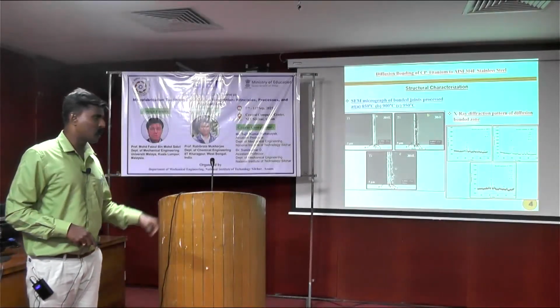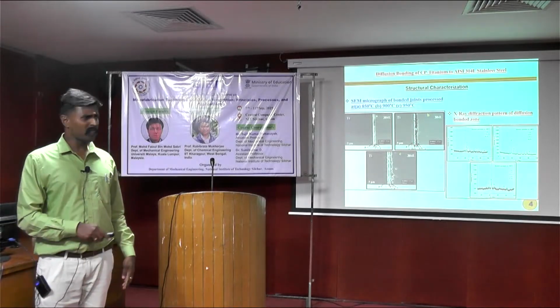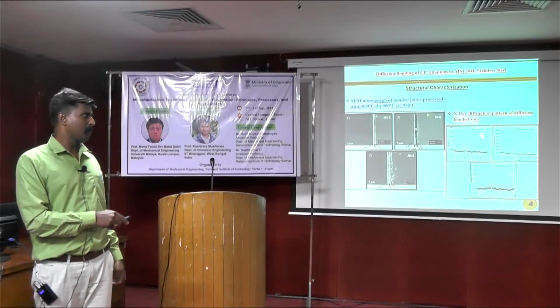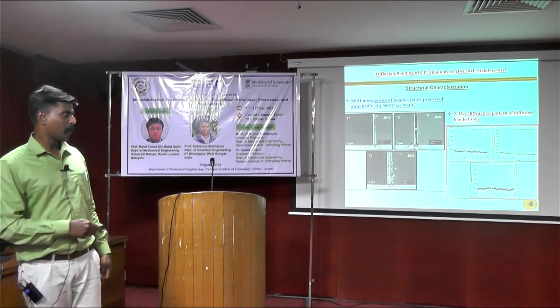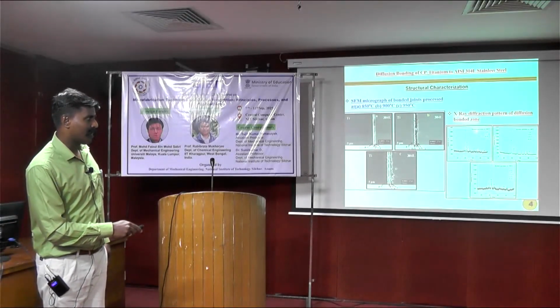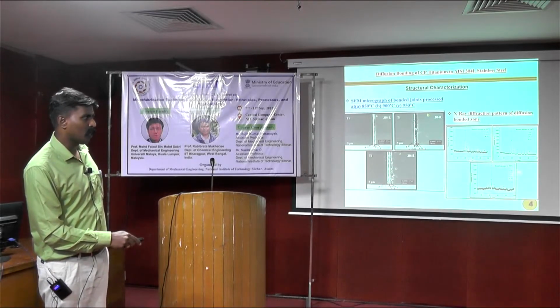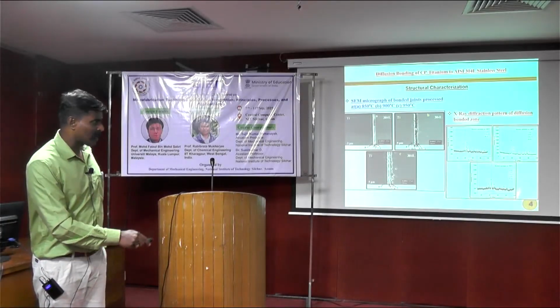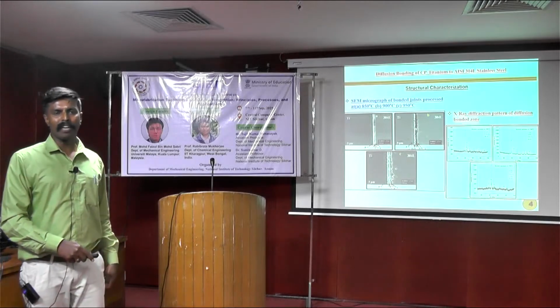To study that, we took the sample for X-ray diffraction. The principle of X-ray diffraction is Bragg's law, n lambda equals 2d sin theta, and from there the peaks come. You can see there is an evolution of the Fe2Ti compound here, and here also. Irrespective of the bonding temperature, in all three specimens there is an evolution of Fe2Ti compound, which is a brittle intermetallic compound.